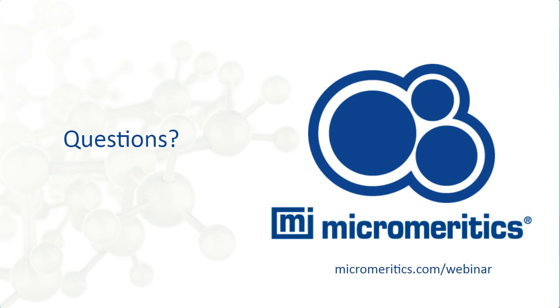Yeah, that is indeed a good and practical question. In general, I think we can say that both methods are good working procedures. And of course, it depends a little bit on your materials. It depends on time. It depends on the surface of the material. In both, what we try to get is a clean surface. And from a practical point of view, in my experience, it's sometimes even more important how I handle the tubes after the degassing, so when transporting from the degas device to the instrument, rather than what type of degas I use.